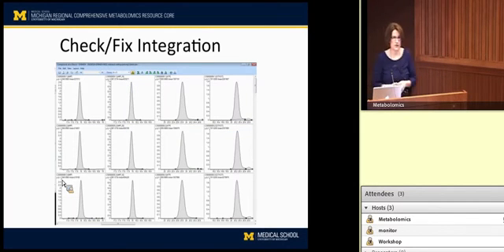So once we've extracted those ions that we're interested in that are part of our assay, whatever we're looking for, we'll put them in this program called Quantitative Analysis. And what I wanted to point out here is these all look really nice. So this isn't really typical, but here I wouldn't really even have to do anything. I would just look at the compounds and say, hey, the instrument did a great job of integrating them. They look great.